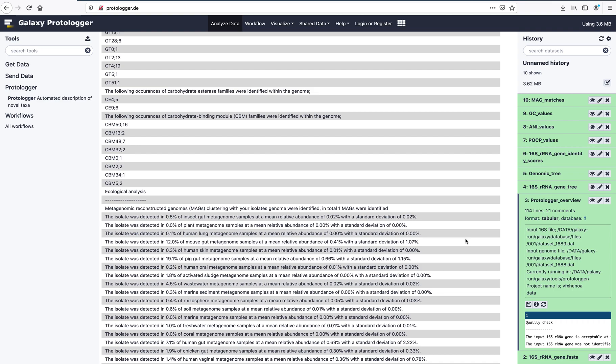As the isolate being studied in this example was cultured from the mouse gut, we will look into this data. As we can see, the isolate occurred in 12.07% of samples, at a mean relative abundance of 0.41%.